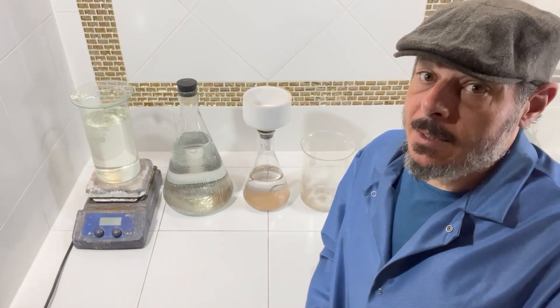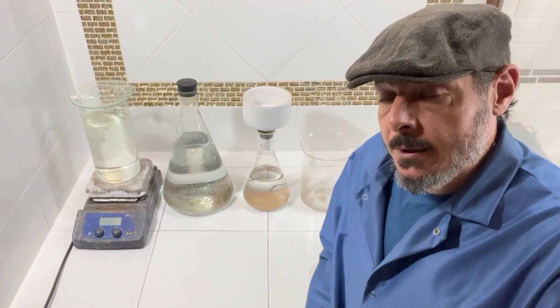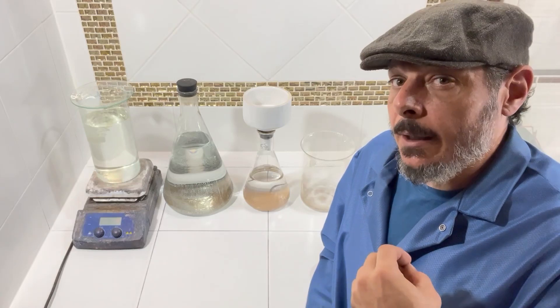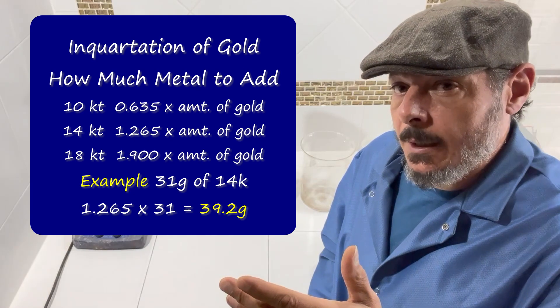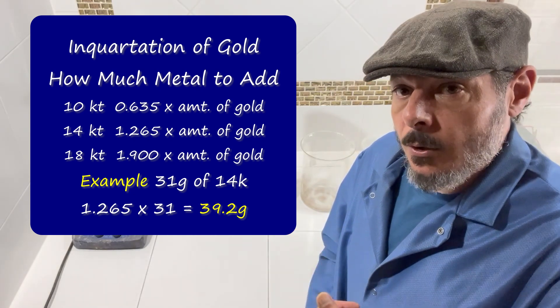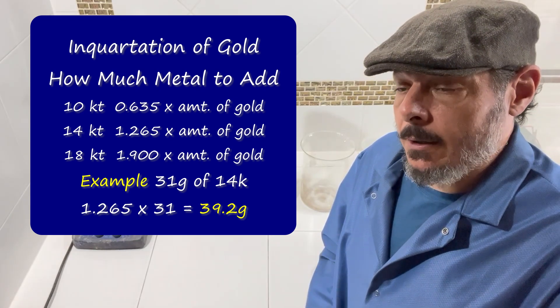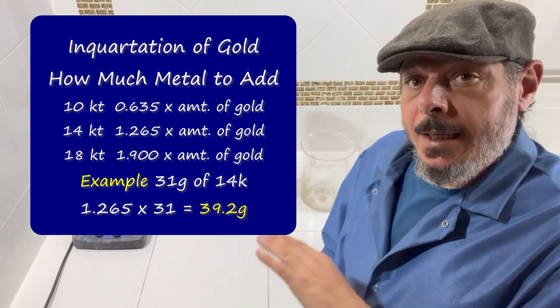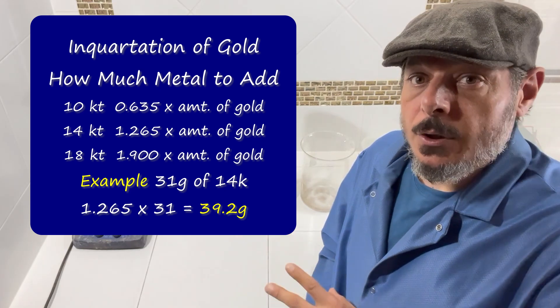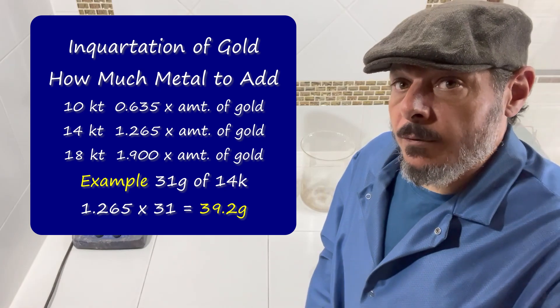Let's get started with the worst-case scenario. What would happen if we inquarted our gold but didn't add enough other metal? Instead of making 6 karat - which is what you'd want your inquarted gold to be below - if it's 24 karat you're going to add the proper amount of other metal. In this case I used primarily silver to inquart my gold, but you want to get it below 6 karats. If you don't add enough metal, the nitric acid and the hydrochloric aqua regia solution will not react with the metal you're putting in solution. Here's what we would do to fix that problem.